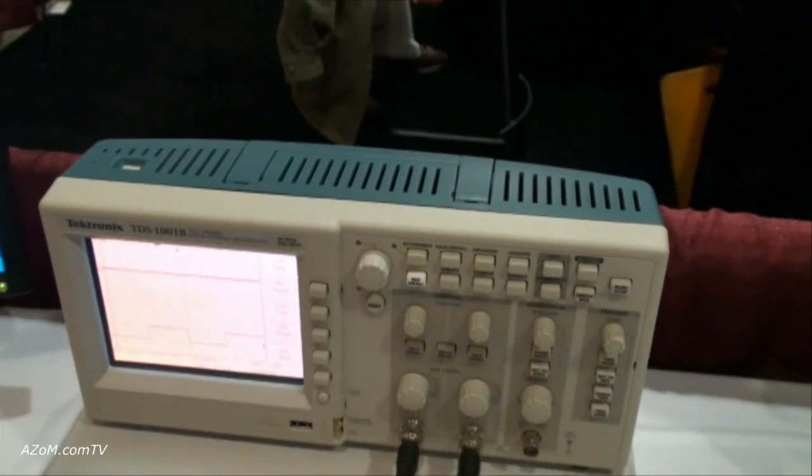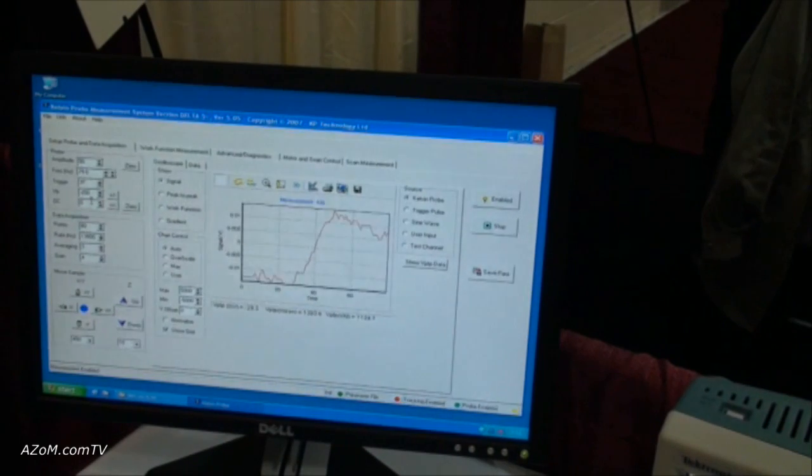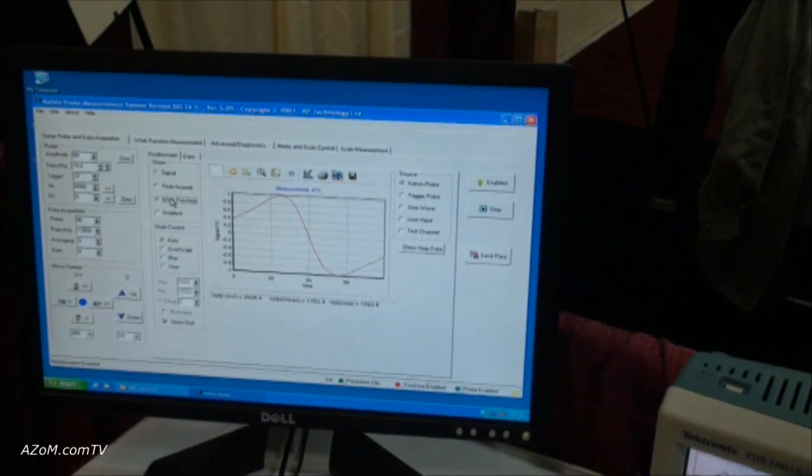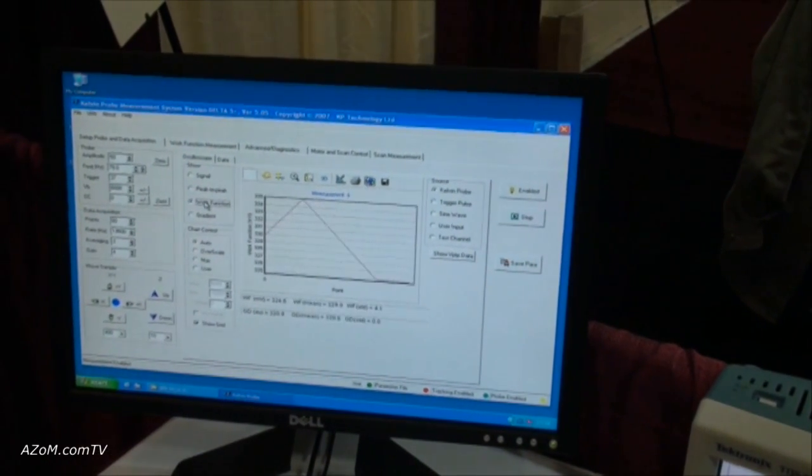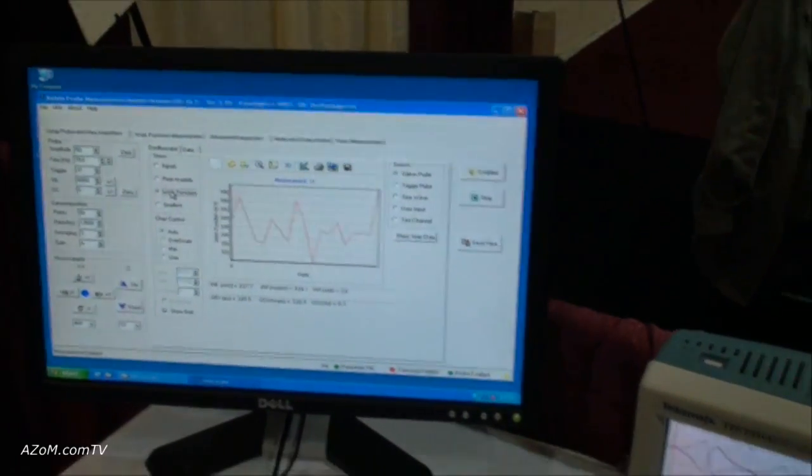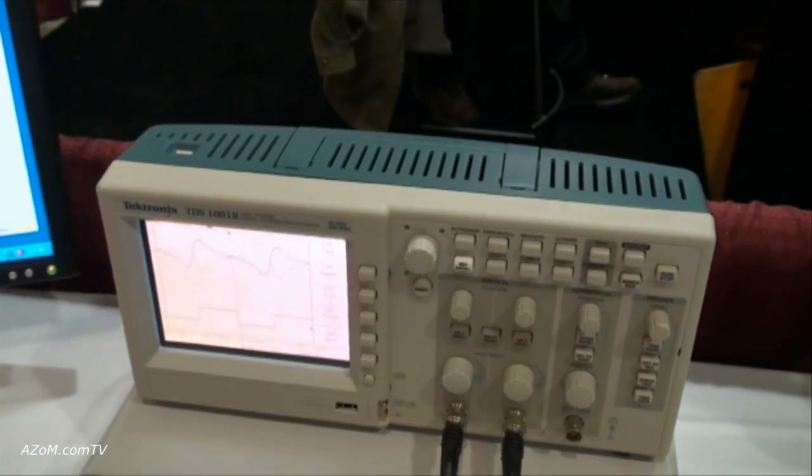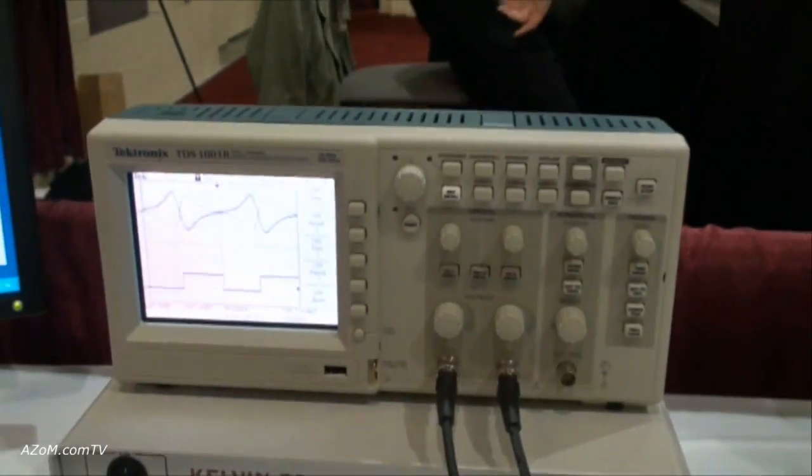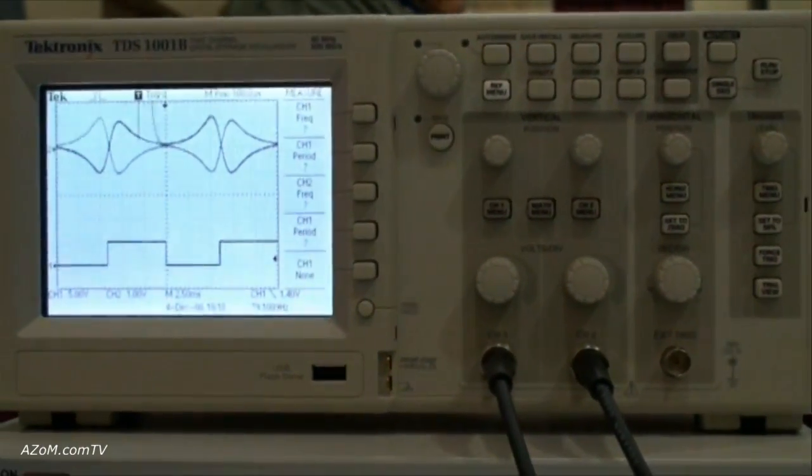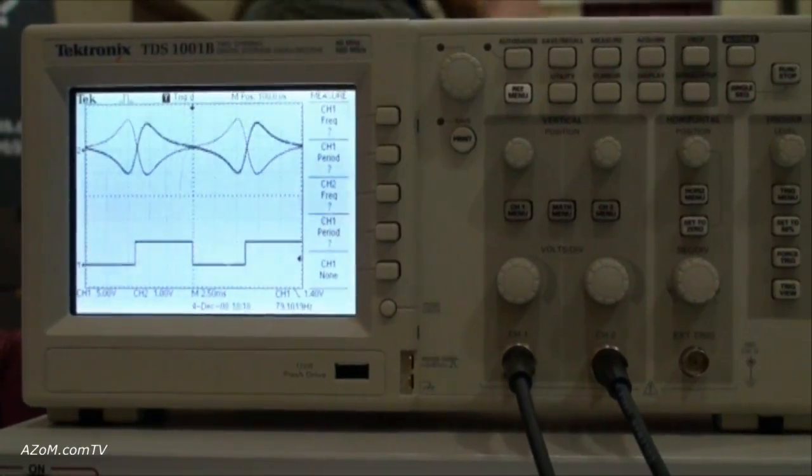The traditional Kelvin probe is a null field, but as you can see, it's a noisy method. I invented the off-null method where you measure on large signal heights. The computer calculates where zero will be through two measurements, and it can go quite fast. It can go up to a thousand measurements a minute. We're working in a conference hall here, so it's a little bit noisy with people going past, but normally you'd achieve one to three millivolt resolution, which is perfectly adequate for most surfaces.